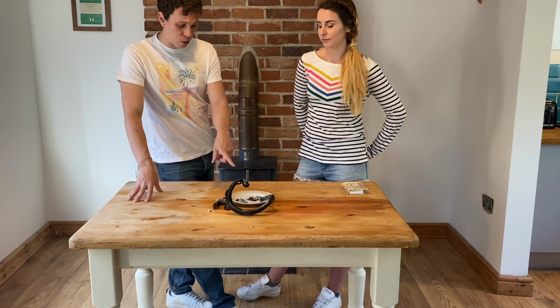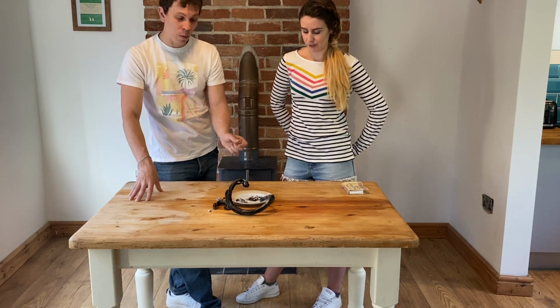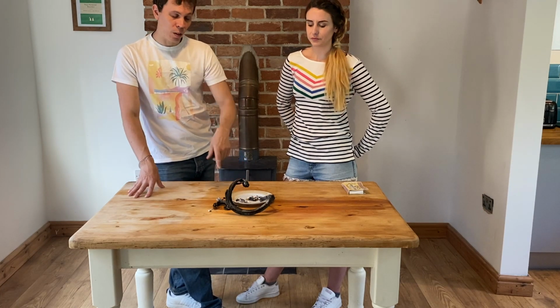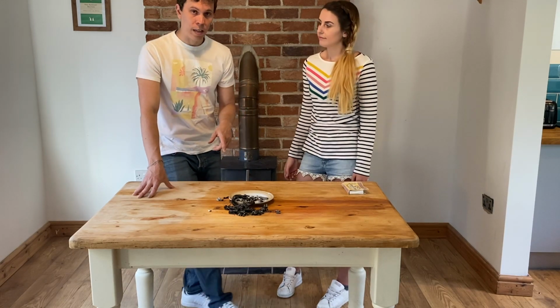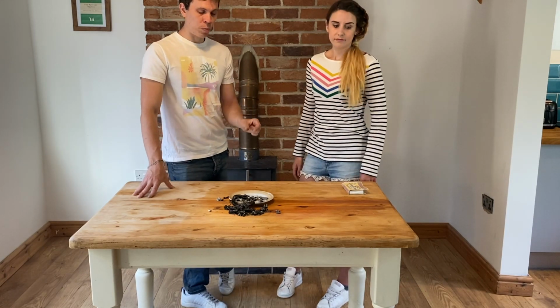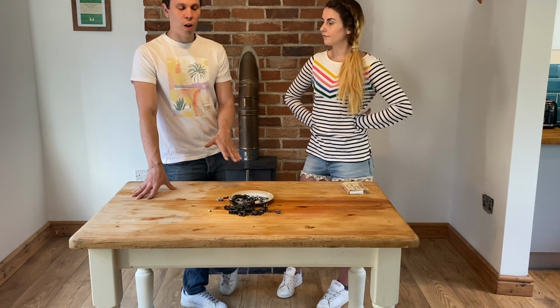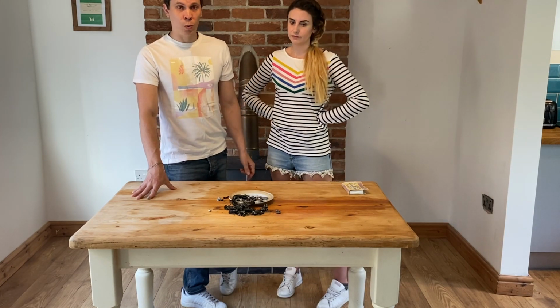I had two chemicals on the plate. I had just a normal fire lighter, which was the flammable bit, providing the heat, providing the flame to burn the other chemical that was sat on top. The experiment we did here today was perfectly safe, but you can do really similar experiments with some chemicals that release toxic gases too, so it's probably not a good one to try at home. But if you want to see the experiment again, I'm more than happy to do it in school when we get back to school.